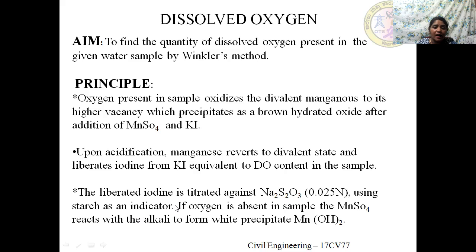Next, this liberated iodine is titrated against sodium thiosulfate of 0.025 normality using starch as an indicator. If oxygen is absent in the sample, the manganese sulfate reacts with the alkali to form a white precipitate, that is manganese hydroxide.